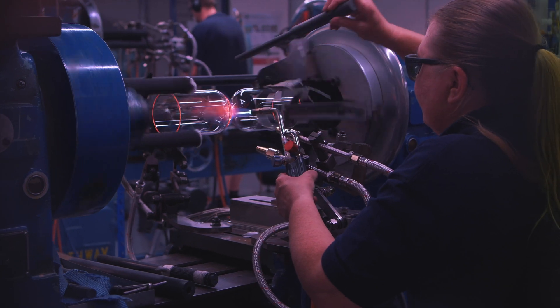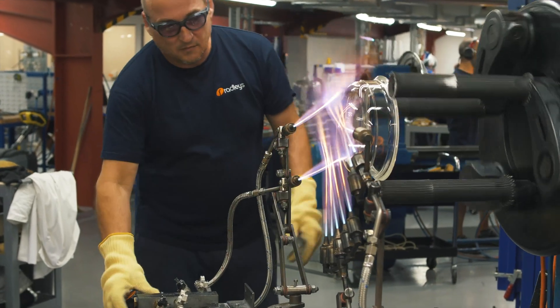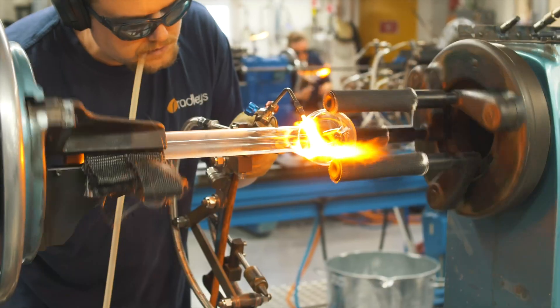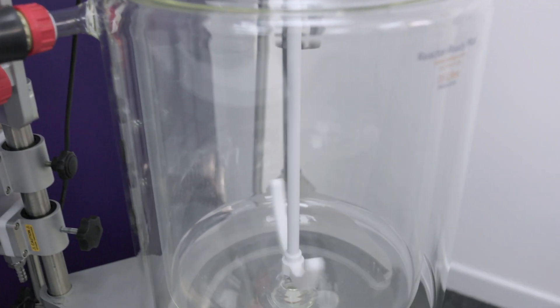Features like this are made possible by our in-house team of expert glass blowers who use high quality borosilicate glass to ensure excellent reactor performance. Good stirring is key to making sure the contents of your reactor are the same temperature, whether that's at the one litre scale on a Reactor Ready Flex or a 20 litre vessel in our Reactor Ready Pilot.